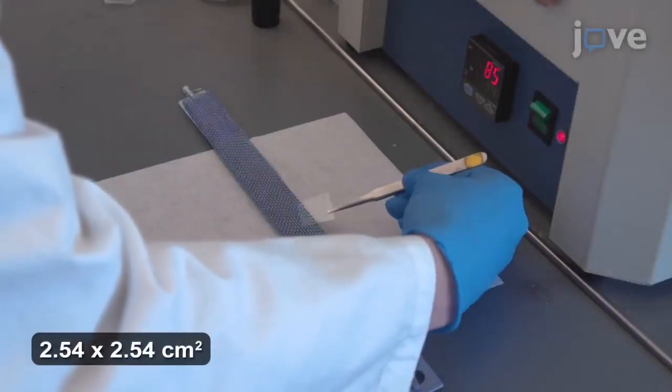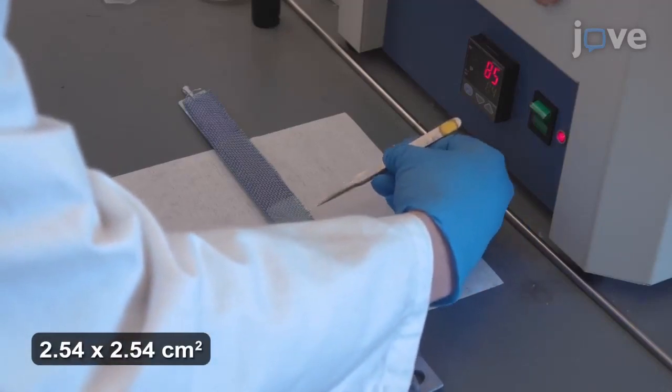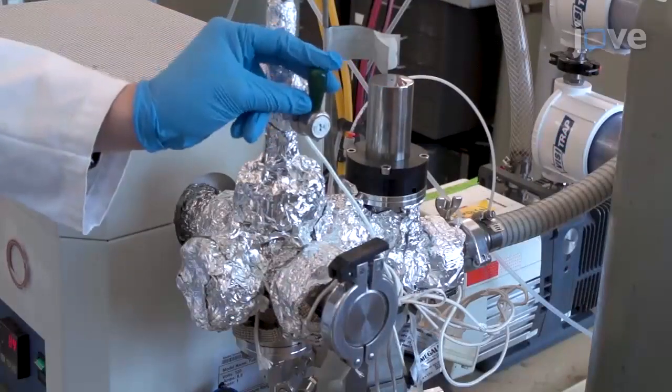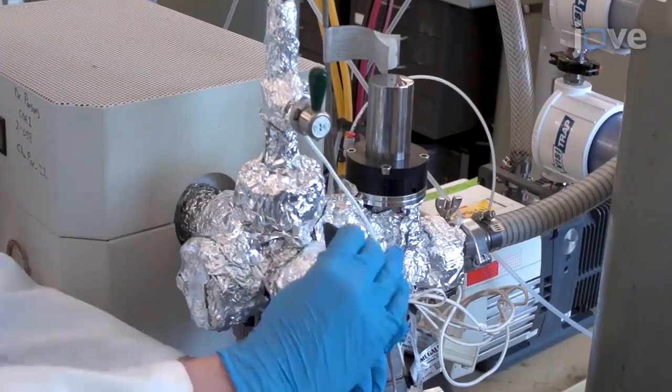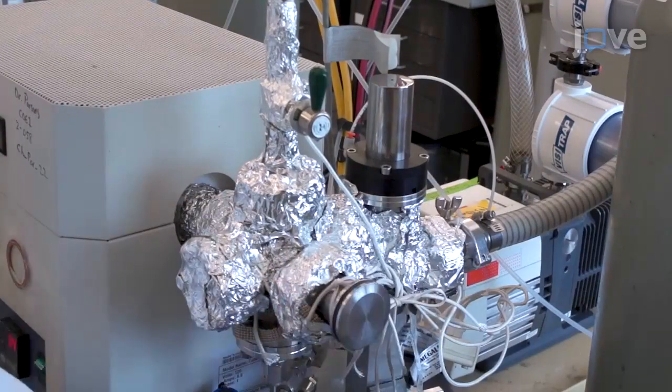First, place a PA-6 fabric sample in a reactor boat. Open the pressure gauge of the ALD reactor and remove the clasp from the reactor cap.